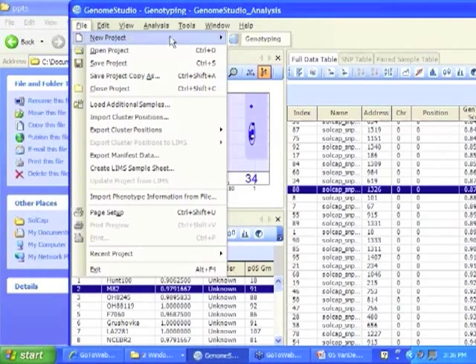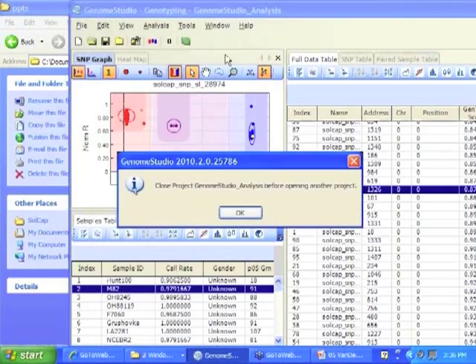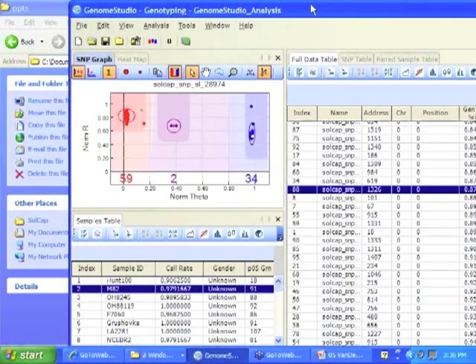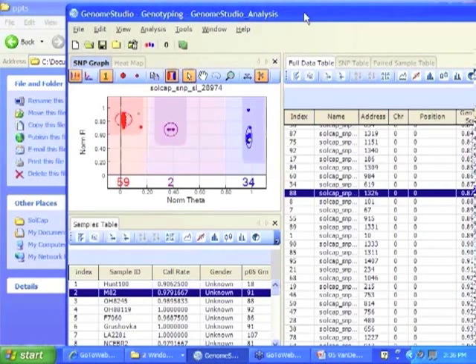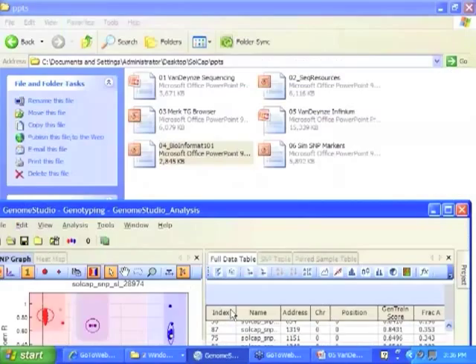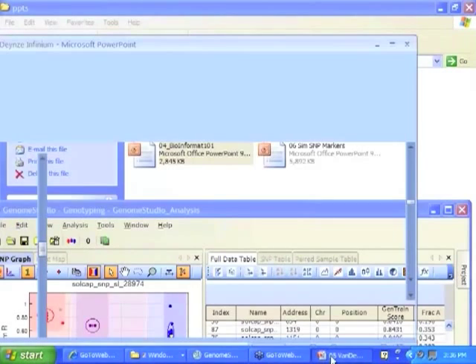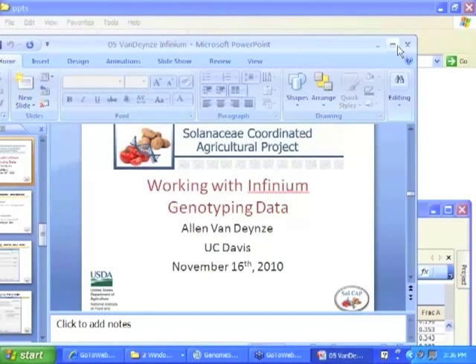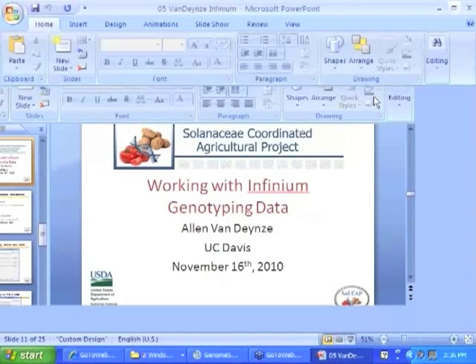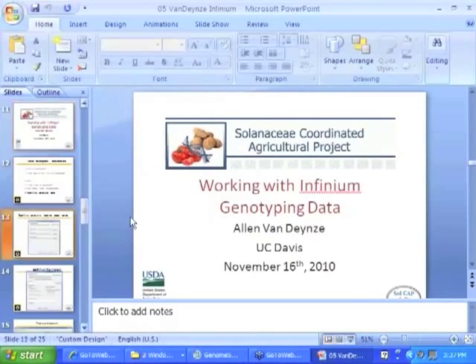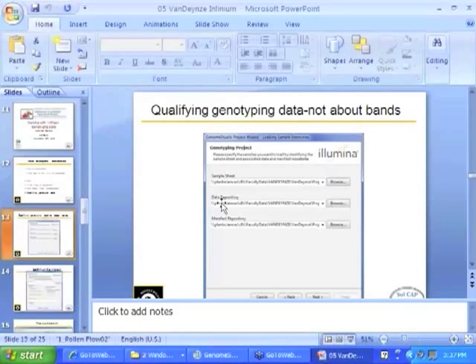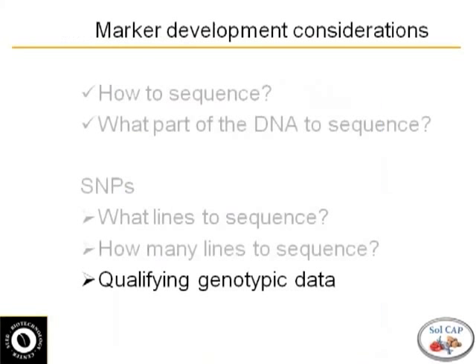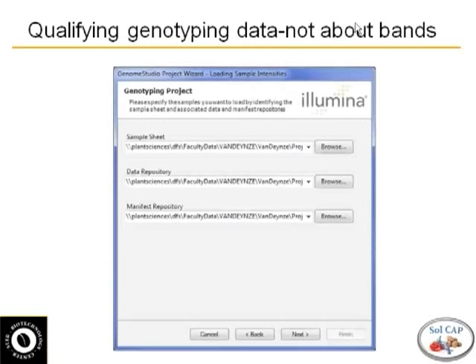So with Illumina, actually I'm just going to go back to my slide on this one. With Illumina, to open a file, when you open a file it's asking for three different things. So when you start a new project, so you just file new, it asks for three things.